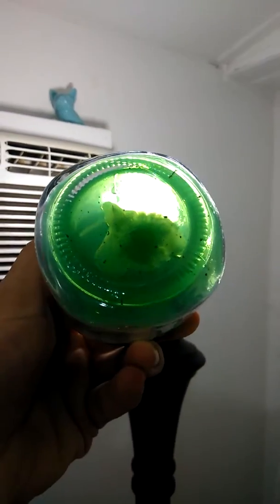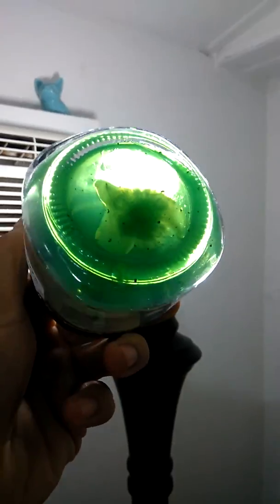I like to pour my agar nice and clear. Although it is blue, you can still see through it. You can see those sectors in there. Then you cut from each one, label it, whatever.